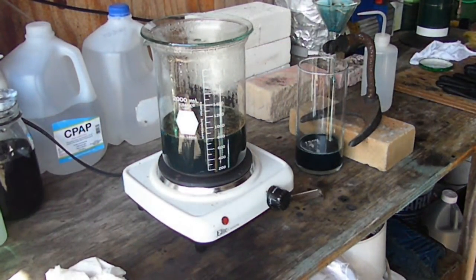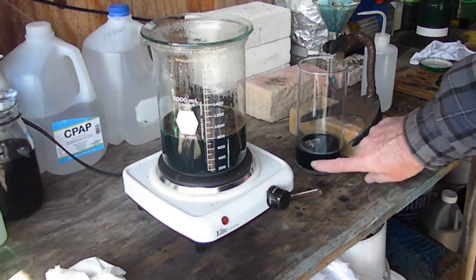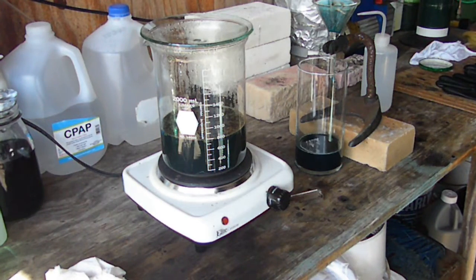Alrighty guys, just touching base with you for a second. We have been filtering for about an hour now, and we still have over 800 milliliters left to filter. So we are going to continue on doing this. We have a super heavy solution of copper nitrate. I mean, you almost can't even see through it. So that's why it took so much nitric acid to do that. And I did figure, like I said, for silver, not for copper. But anywho, we're just going to continue to do this. We probably got at least a couple more hours. So I'm going to find some things to do, and we will get back at you in a bit.